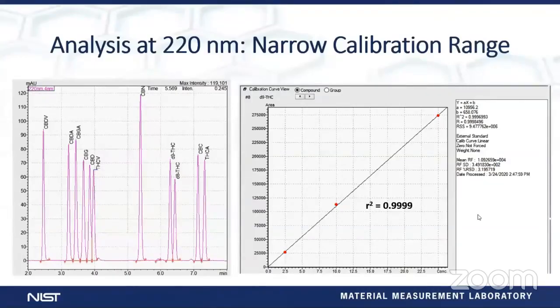One of the things I can tell you that does happen a lot, why people get results that are varying off, is that they try to use a 3 to 4 calibration range for their analysis. We've seen through our QAP program that this is primarily the reason why a lot of labs will have a bias high or low depending on the accuracy. Because when you get much longer calibration curves, that last point at the top is going to severely influence your accuracy at the low range. And you really need to know what your target point is. If 1% is your target point, you need to really center your calibration curve around that 1% cutoff point.